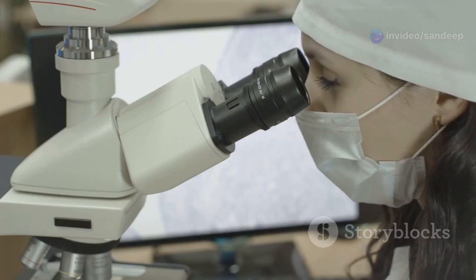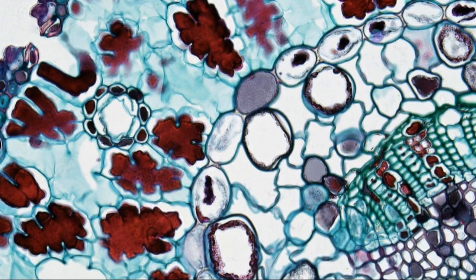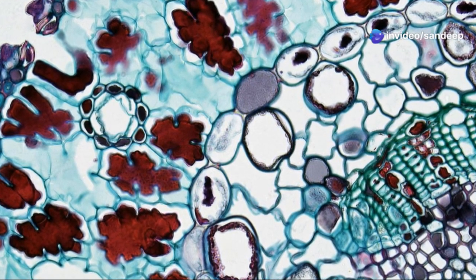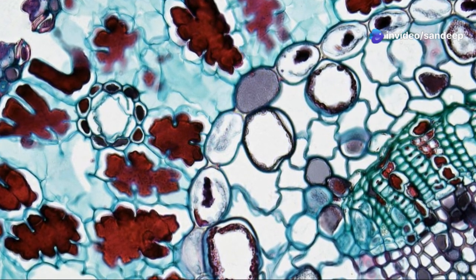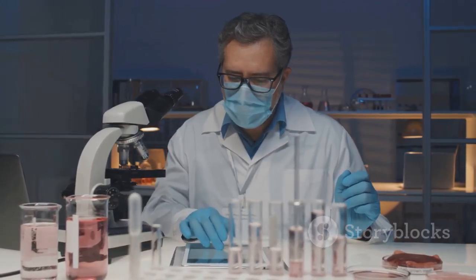Imagine being able to zoom in on a seemingly insignificant speck of skin or a tiny piece of an organ. Histology makes this possible, revealing a hidden world of cells, each with its own unique structure and purpose. By examining these cells, we can learn a great deal about the health of the body.